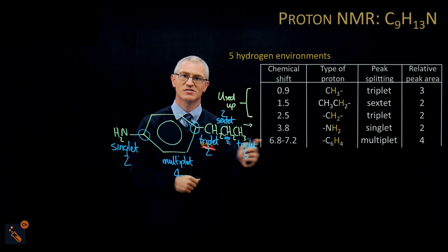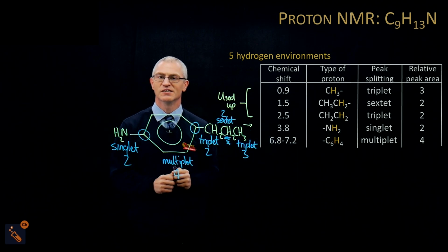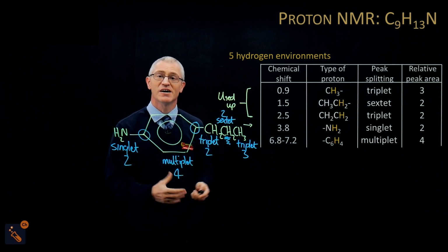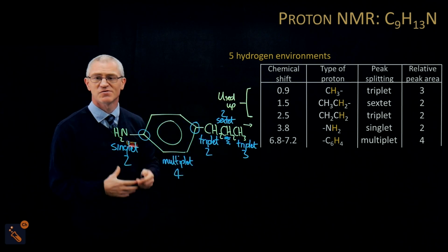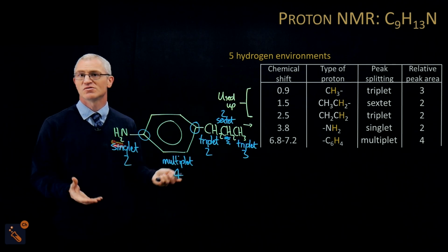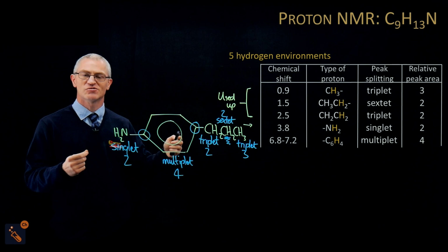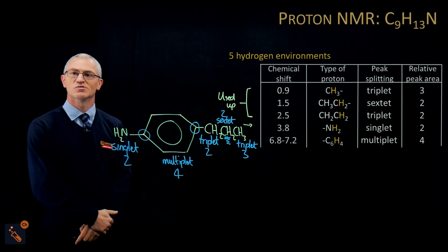Okay, well that's next to another CH2, which I've already assigned here. So what I can do is just put it next to that CH2 and then highlight it again. Okay, and that makes it unambiguous. So just be really careful if you've got any structure where it could be ambiguous. You've got two CH3s, for example, or you've got two CH2s and things like that. You might have to put a bit extra part of the molecule in just to make sure you get all the marks.